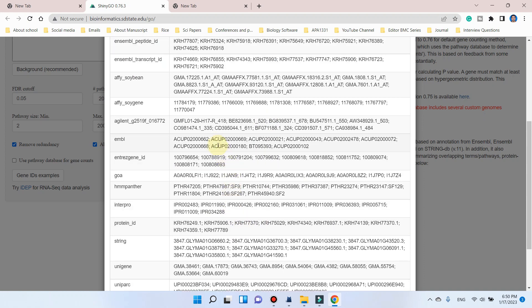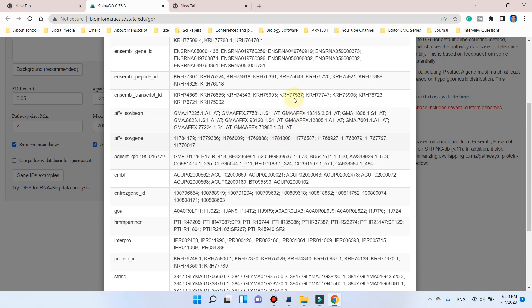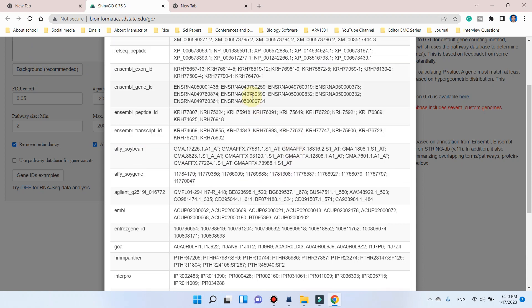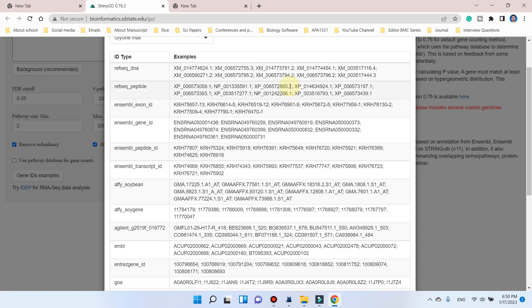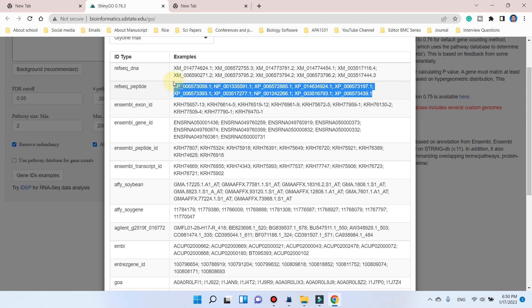Let me try to take a few genes from this list so that we can check whether these IDs are acceptable or not. Let me take this one.